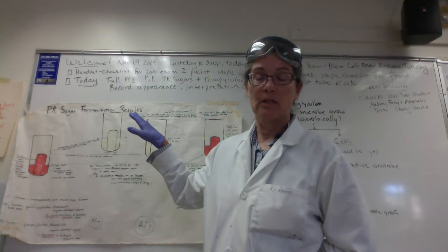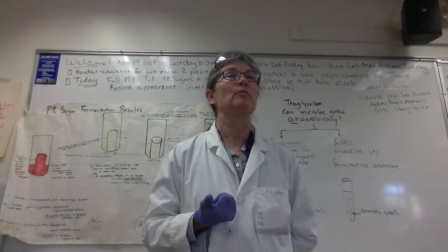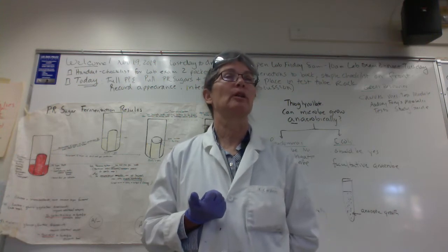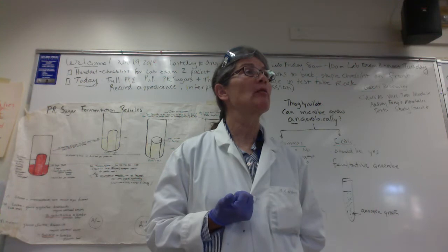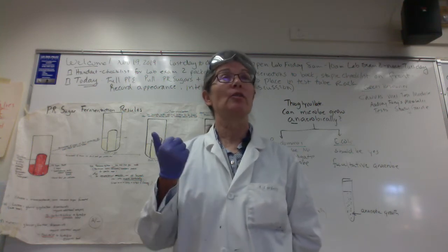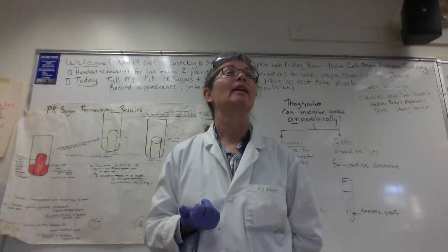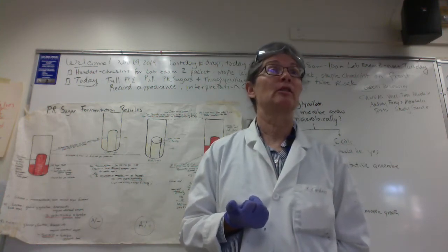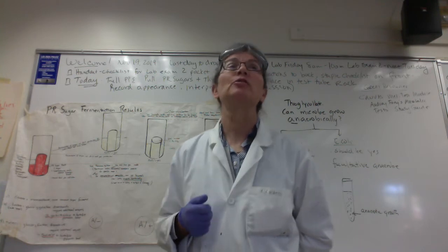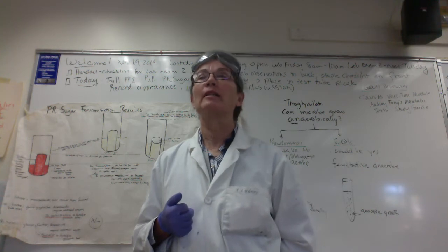So what the PR sugar tubes can tell us, first of all, is: was the sugar fermented? If the sugar was fermented, a typical fermentation end product is acid, so the pH goes down and phenol red turns yellow. If your PR sugars appear yellow after incubation, your microbe can ferment that specific sugar. And if your microbe also made gas, you'll look for a gas bubble in the Durham tube. You can see this clearly in the E. coli tubes.